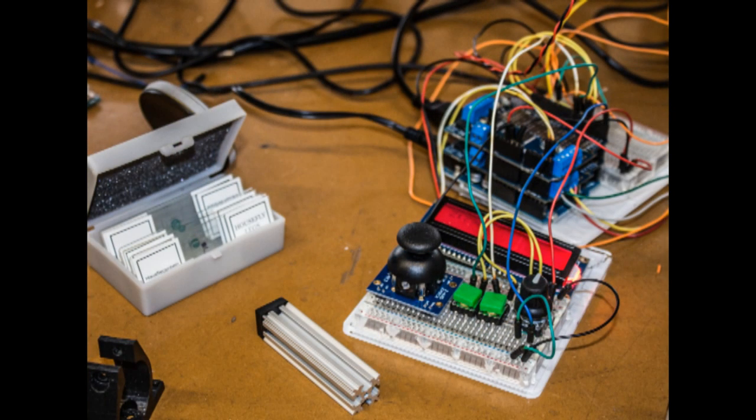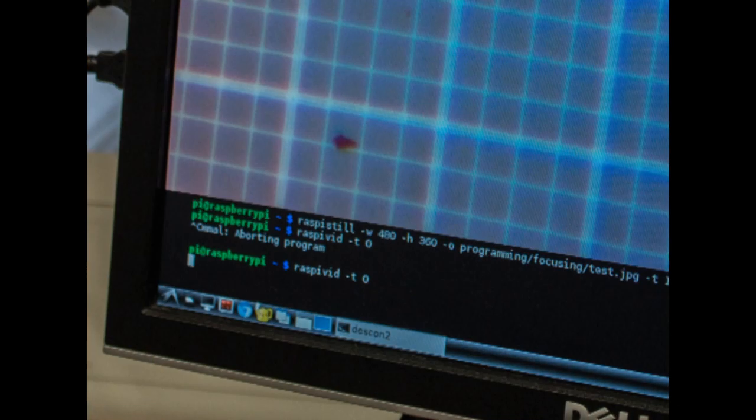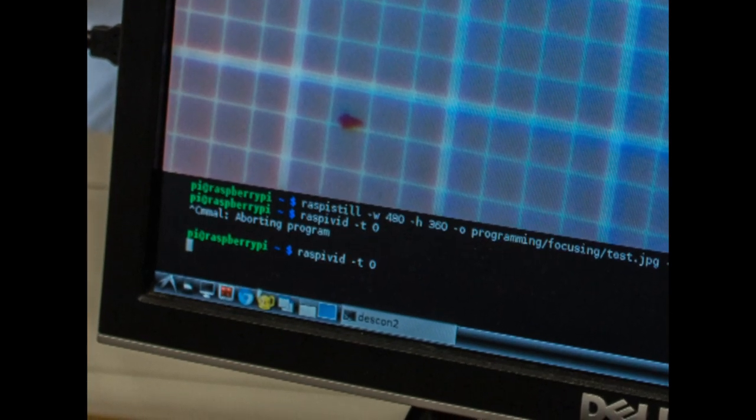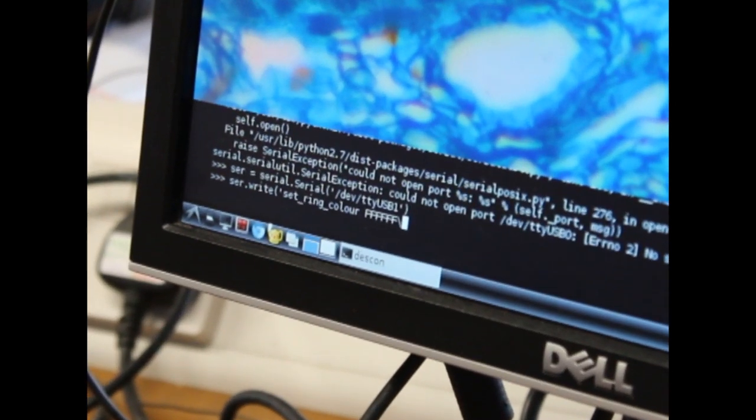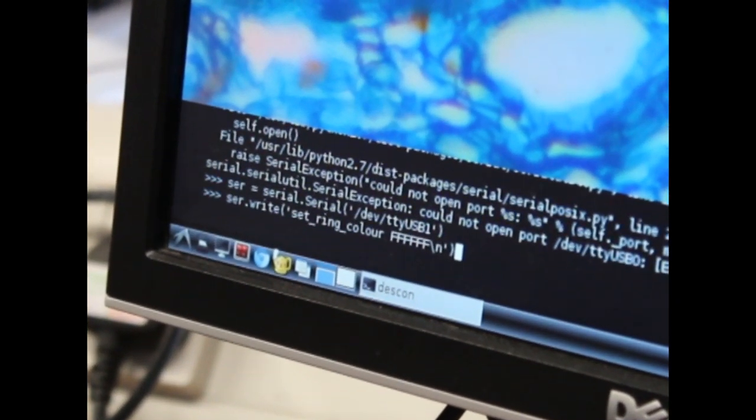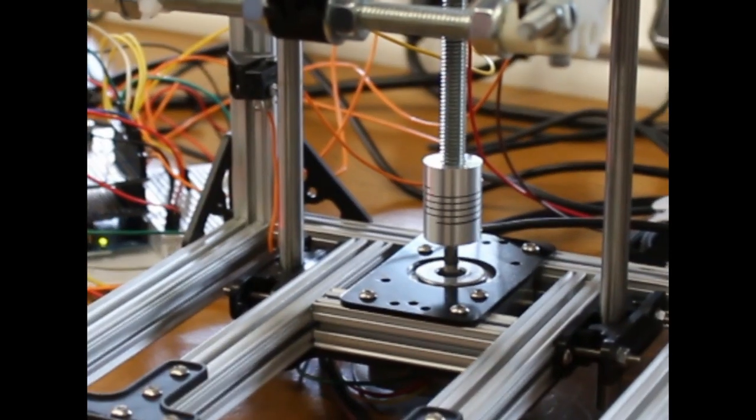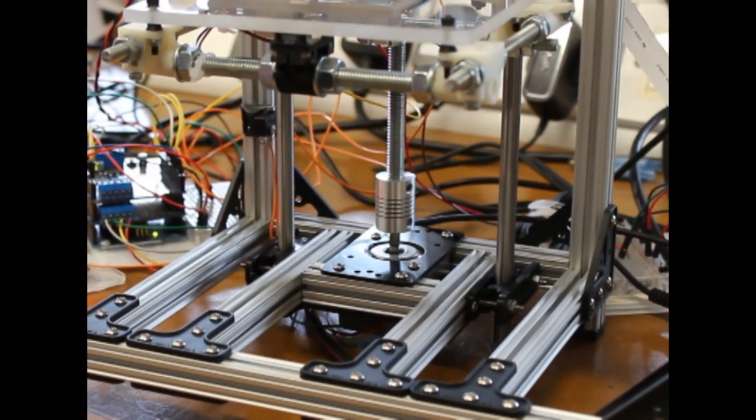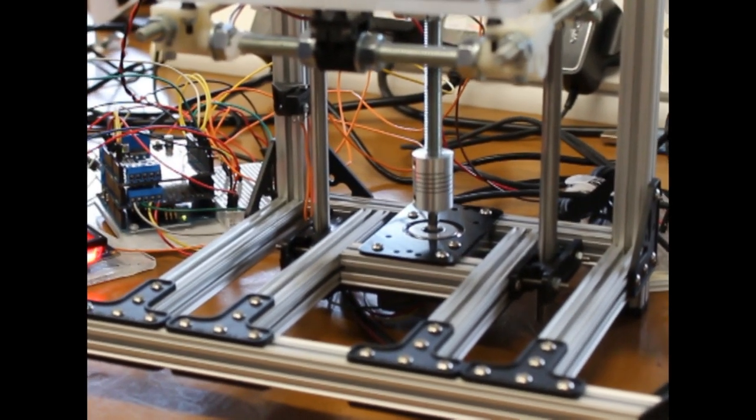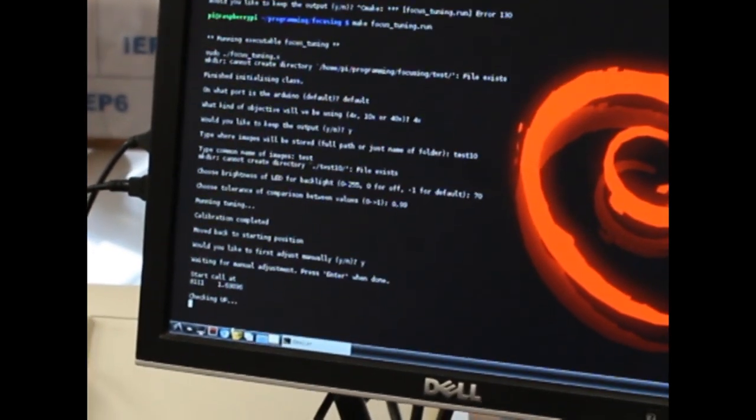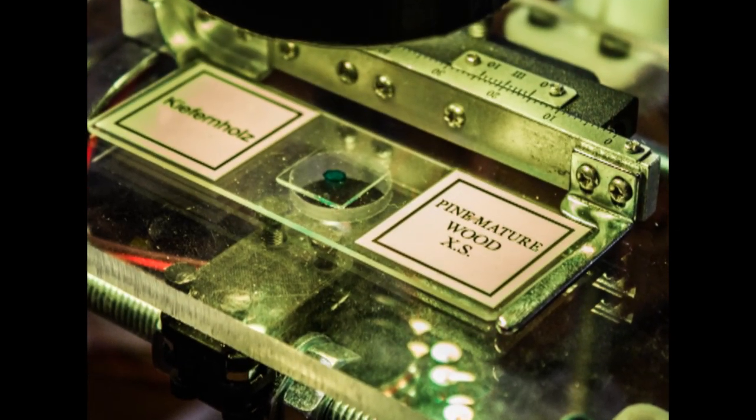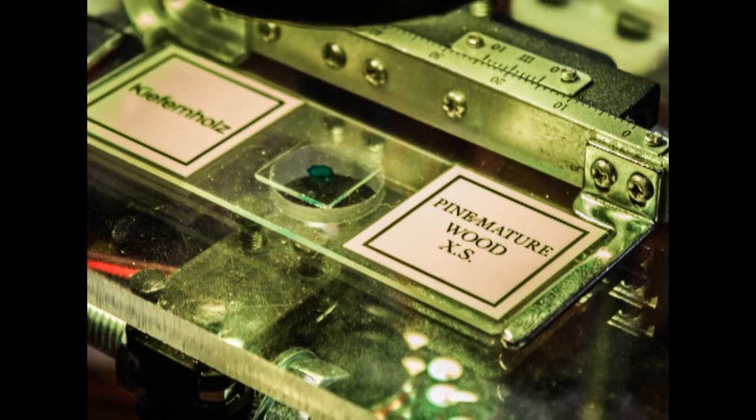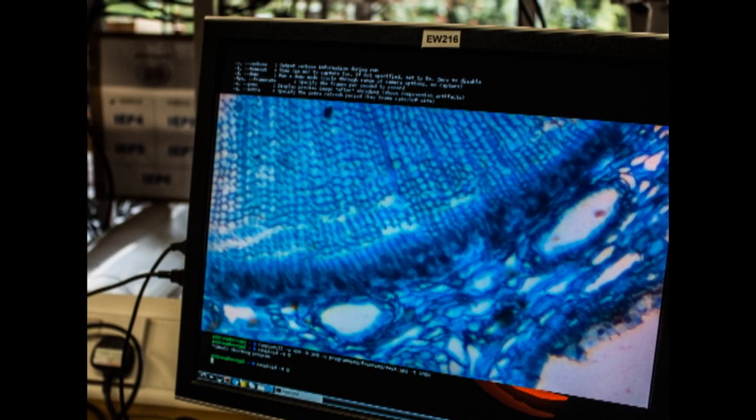So what I've been working on is actually putting all the parts of the microscope together to automate some functions. And for example, what the demo will show is how to run autofocusing. We can run this program that will try to autofocus the image and then we can display the results.